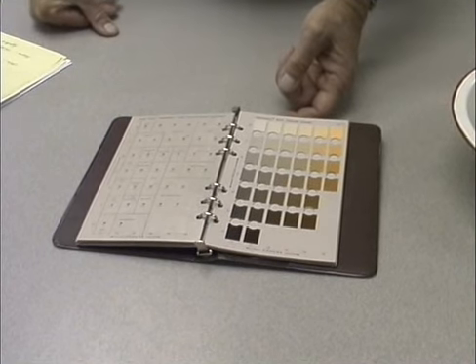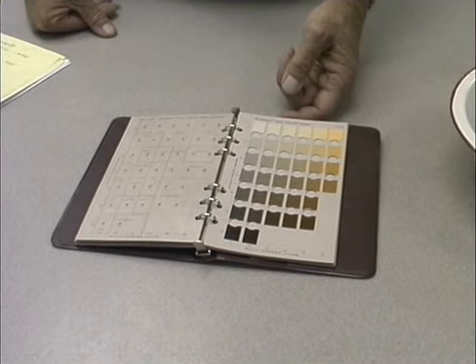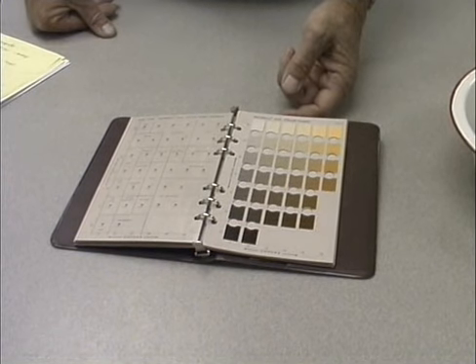So in this exercise today, I'm going to take peds from several different soils, similar to the ones that we've just examined for soil texture, place them on this chart, and determine the hue, the value, and the chroma, or the Munsell soil color notation for that particular soil.